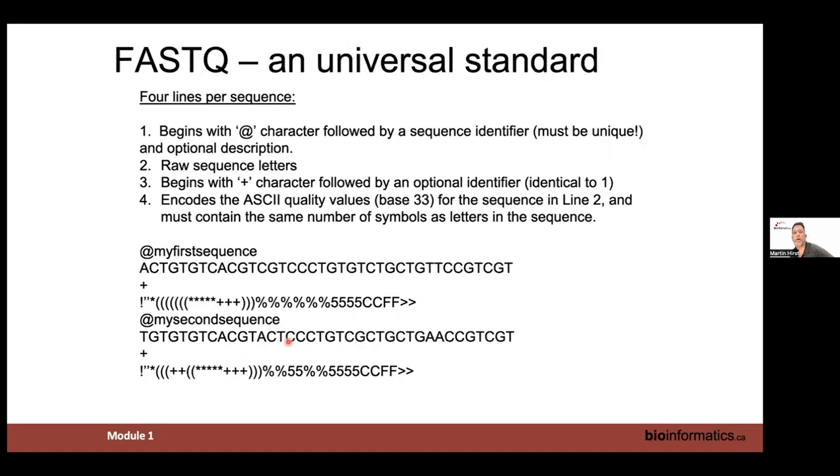And that is then used as the unique name for that particular sequence that is then carried through the rest of the analysis. And that unique name is absolutely required to allow us to work with, for example, indexed reads or paired end reads, because it's the one handle that allows us to relate the sequences to one another.